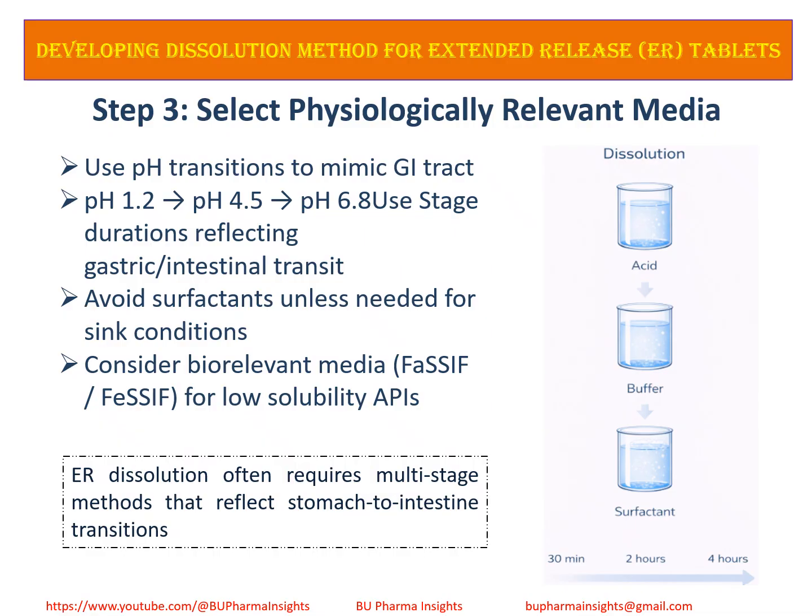Key principle to remember: avoid surfactants unless they are truly needed for sink conditions. Use biorelevant media like fasted or fed intestinal fluid for low solubility APIs when justified. Always balance physiological relevance with method discrimination.